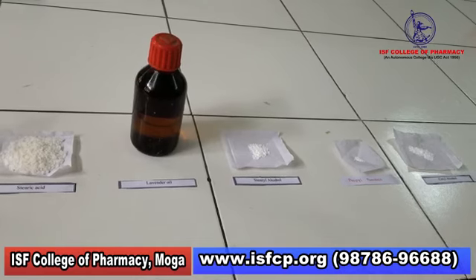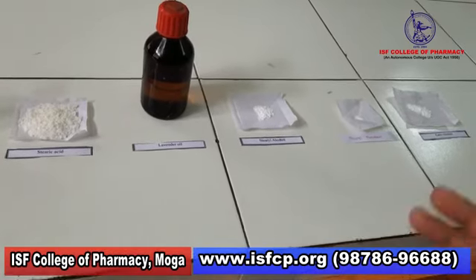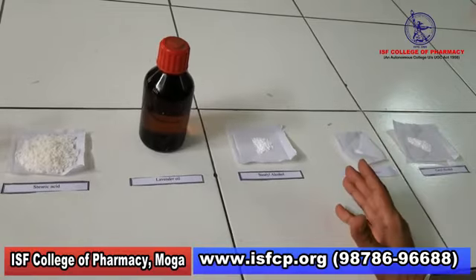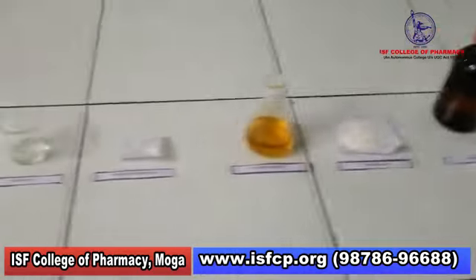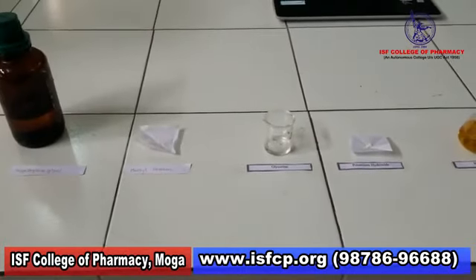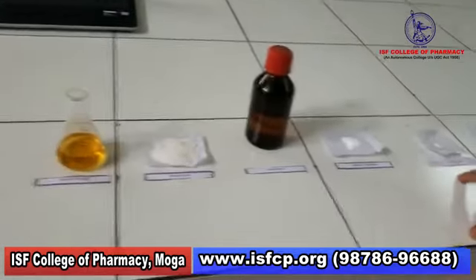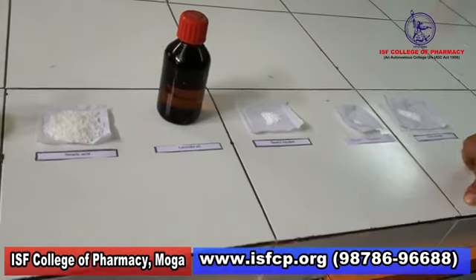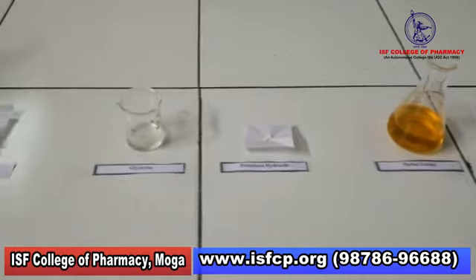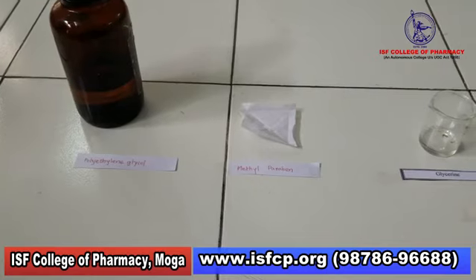So the first step is to segregate the ingredients as per their solubility. Oil soluble ingredients are to be placed in one group, and the aqueous soluble ingredients in the second group. In the oil phase, we will take stearic acid, lavender oil, stearyl alcohol, propyl paraben and cetyl alcohol. On the aqueous side, we have the herbal extract, potassium hydroxide, glycerine, methyl paraben and polyethylene glycol.